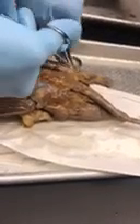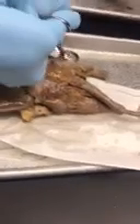That's the best way to get that top layer of connective tissue off. So you can grab it with the forceps. That usually tends to get the best grip. It's easier than grabbing it with your fingers. And then pull that connective tissue off by cutting right next to the surface of it.